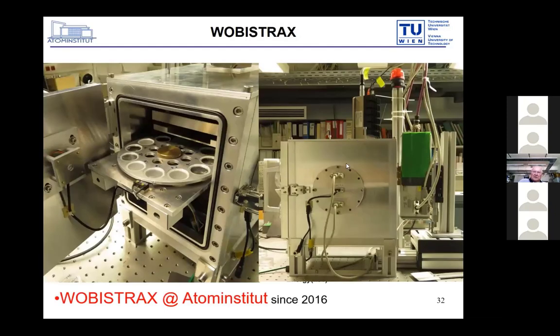This is our system, which we have had since 2016 at our institute. So the same technical part, the sample changer, but here is the X-ray tube and the detector from the top. And we can, of course, use several types of detectors, sizes, areas, and window types.